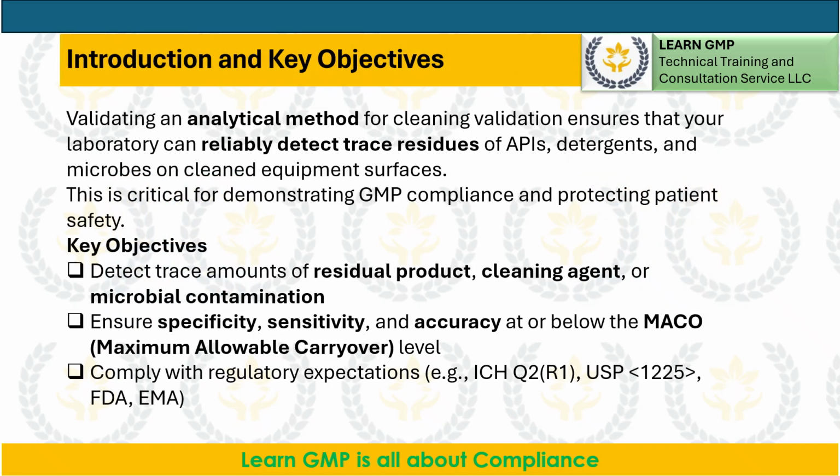Introduction and key objectives. Validating an analytical method for cleaning validation ensures that your laboratory can reliably detect trace residues of APIs, detergents, and microbes on cleaned equipment surfaces. This is critical for demonstrating GMP compliance and protecting patient safety.